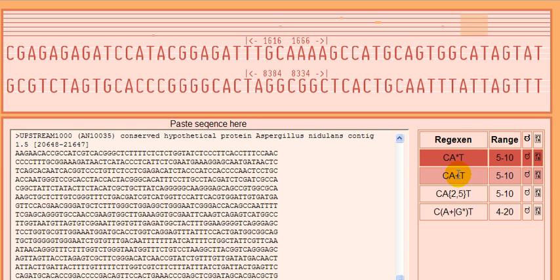The more means as many as possible, of course within the range that we've defined, but we'll ignore this for now. So the difference here is that we could skip over the A in the first instance of the first regular expression definition, but in this one we can't do that.